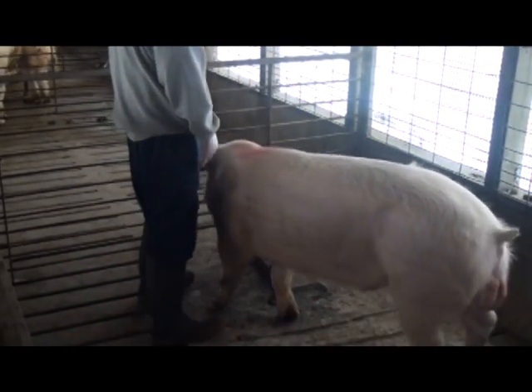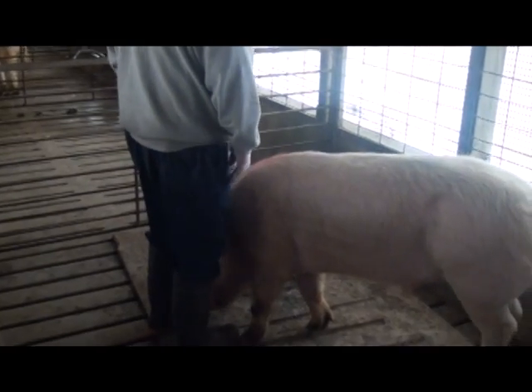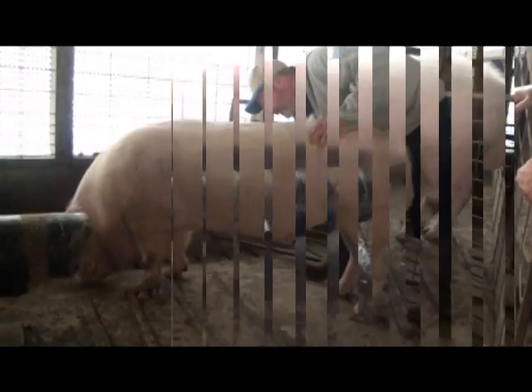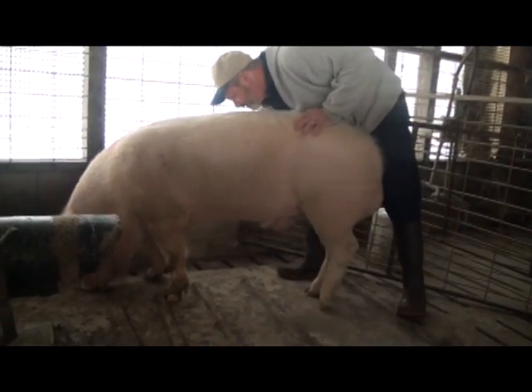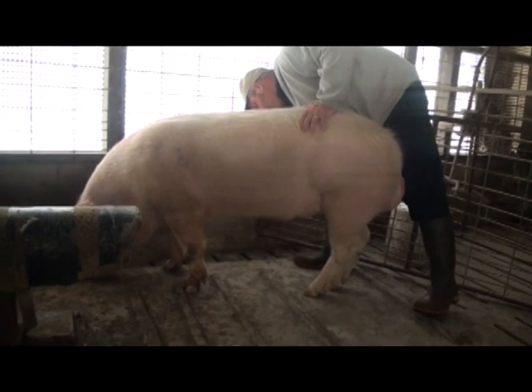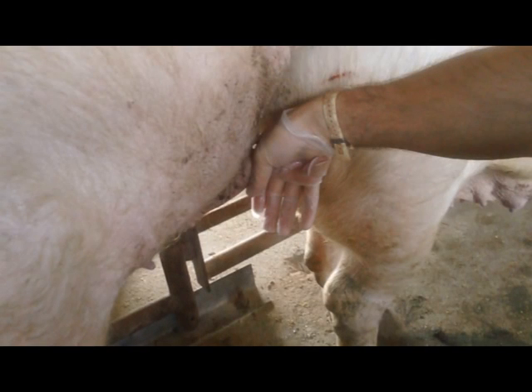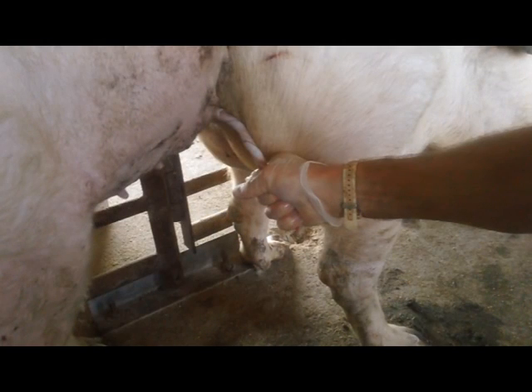The training session begins by giving the boar freedom to inspect and explore the collection pen and dummy. After this, we can enter the pen and begin directing him into position to keep his focus on the dummy, or use a swing gate to temporarily keep him closer to the dummy. We will begin massaging the boar's back, flank, and underline to get him used to human contact, eventually moving on to direct stimulation of the penile sheath. When the boar begins to extend out of the penile sheath, we grab the glans penis with a firm grip to provide the pressure stimulation needed for full erection and ejaculation. We should never try to pull the penis out of the sheath — the boar must always achieve a full erection on his own.